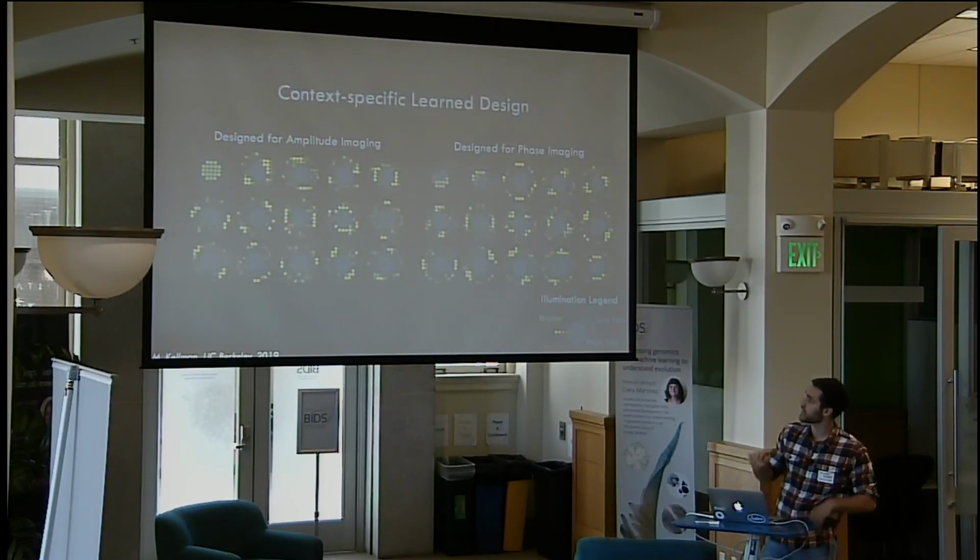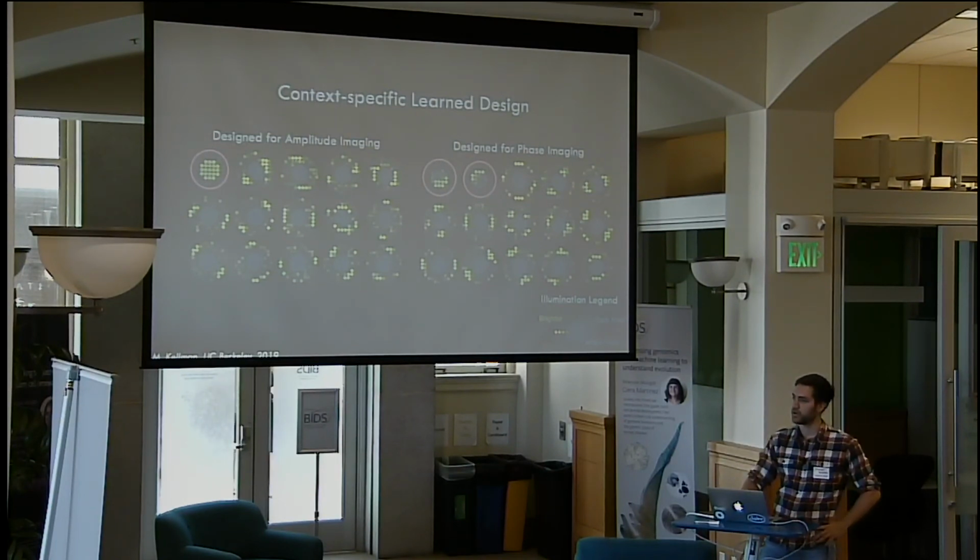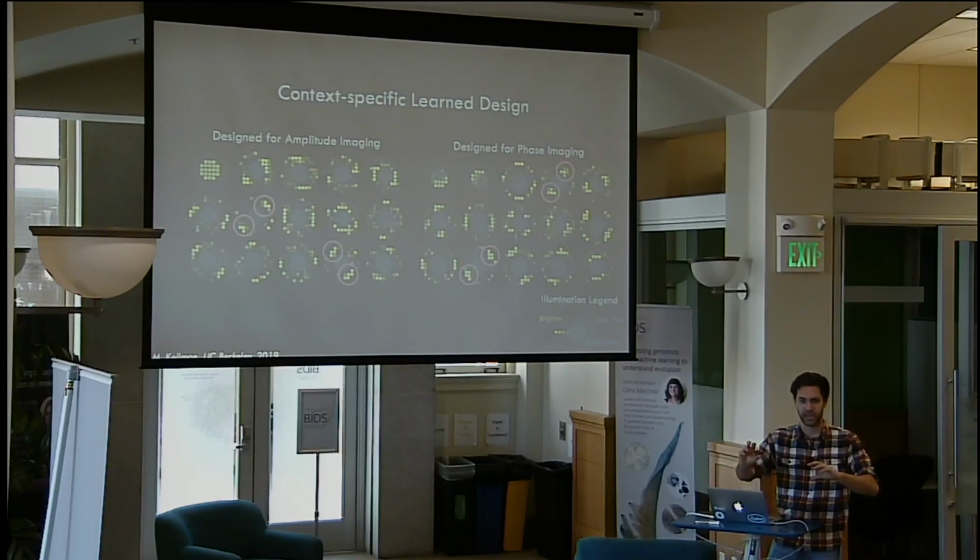Looking at the two contexts, we can see that the information encoding the low frequencies is fundamentally different for these two applications, which is one of the nice things we get by including data-driven knowledge about the system in our methodology. And then in the higher frequencies, LEDs are turned on in sets, like conjugate pairs in these clusters.